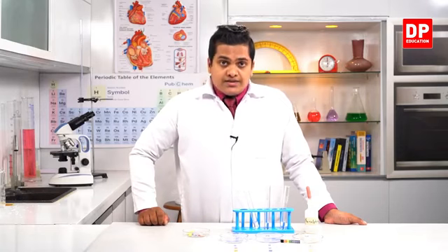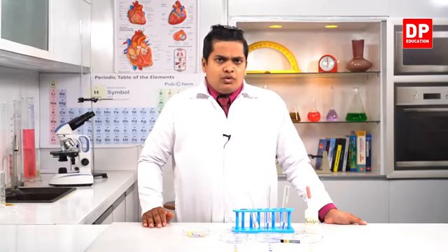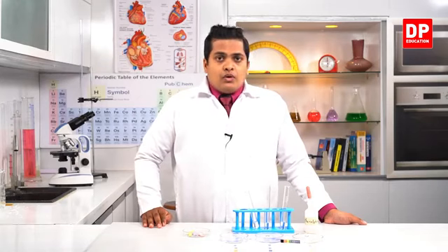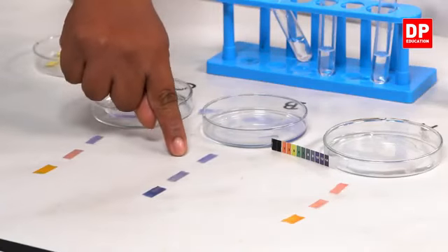If you take bases, bases have a blue related color like purple, light blue, blue color, dark green. Those kinds of colors are blue related colors. So bases show these blue related colors, right? You can observe these things are very clear to us.